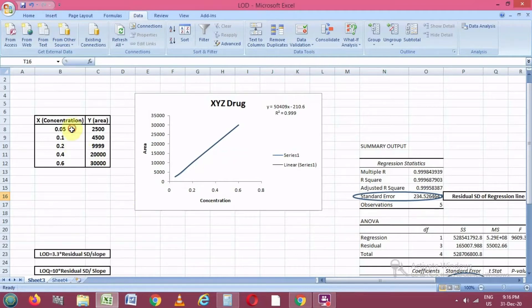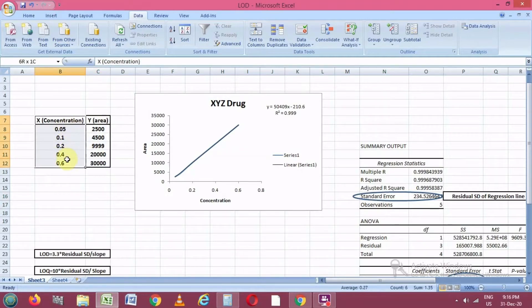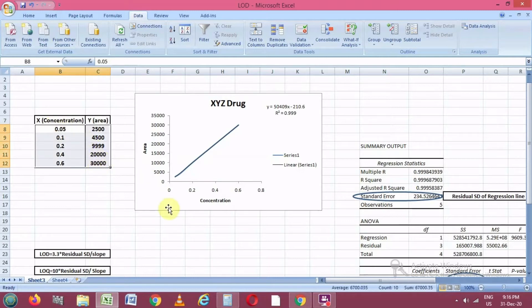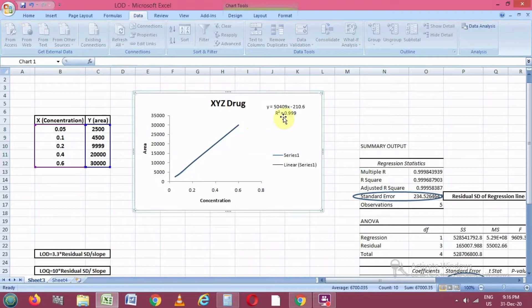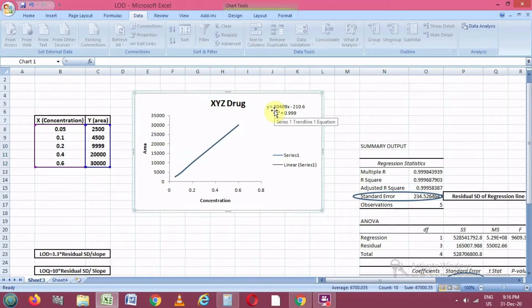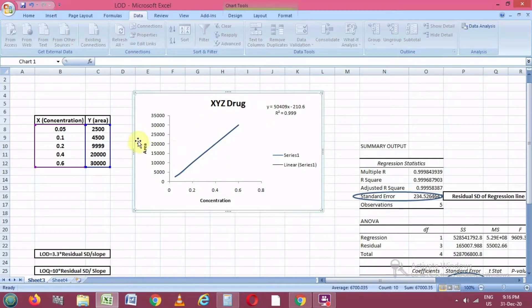To calculate this, we go to our Excel sheet. In the Excel sheet, I have plotted the X and Y axes — on the X axis I have taken the concentration of the drug, and on the Y axis is the area corresponding to these concentrations. First, we have to plot a linearity graph so that we can get the slope value and also verify that the areas corresponding to the concentrations are linear.